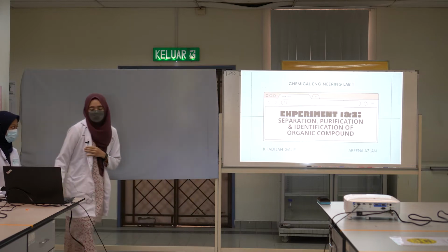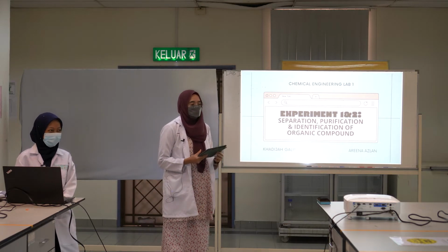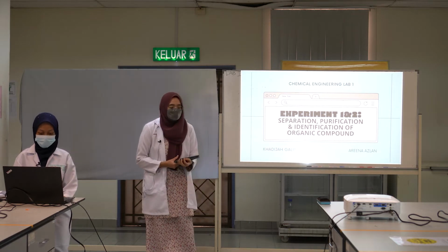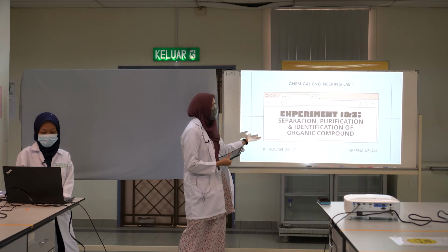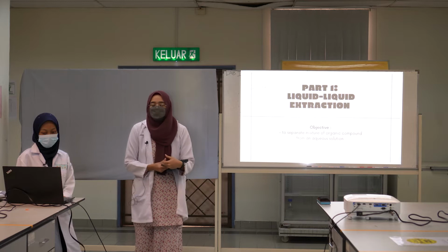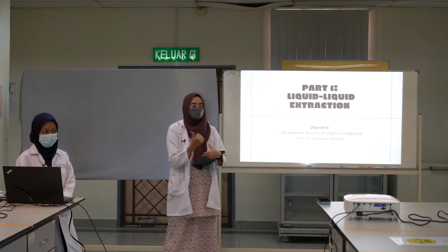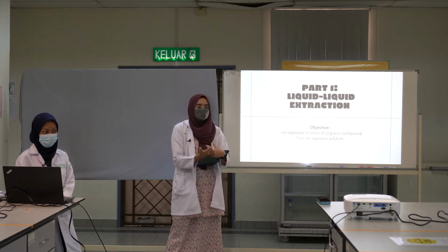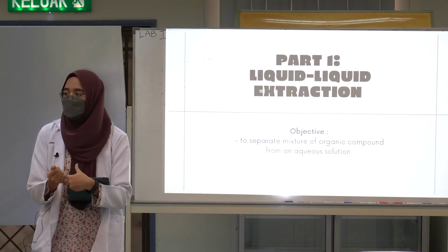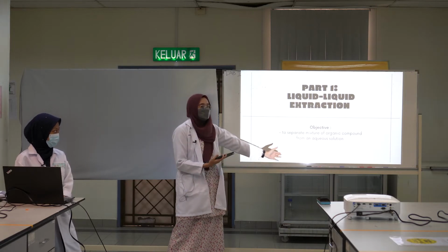Assalamualaikum warahmatullahi wabarakatuh, and a very good afternoon to everyone. My name is Aina Sofia binti Kamar Azlan, and this is my group mate, Khadijah Galib. Today we'll be presenting on experiments 1 and 2, which is separation, purification, and identification of organic compound. There are 6 main points in this experiment: liquid extraction, precipitation, distillation, melting point, thin layer chromatography, and recrystallization. My first part is the liquid extraction.